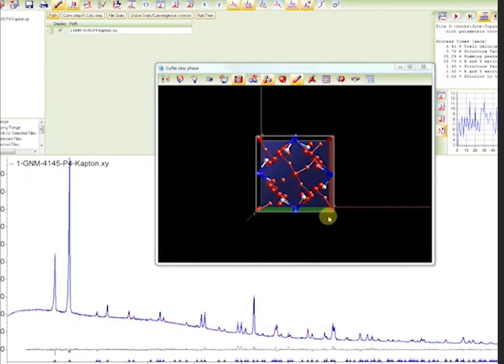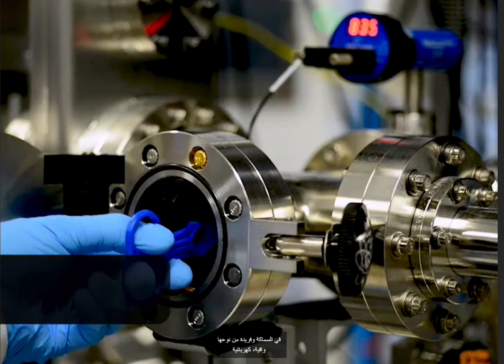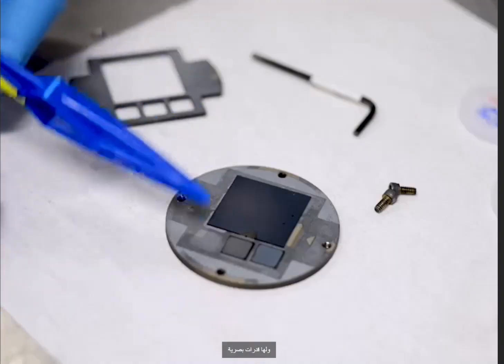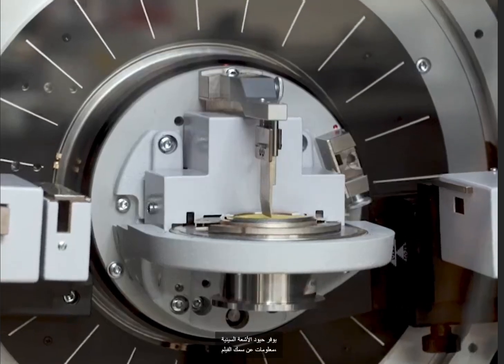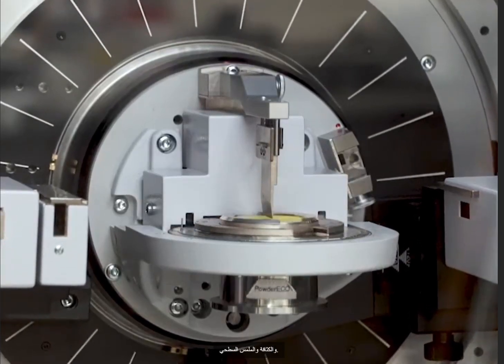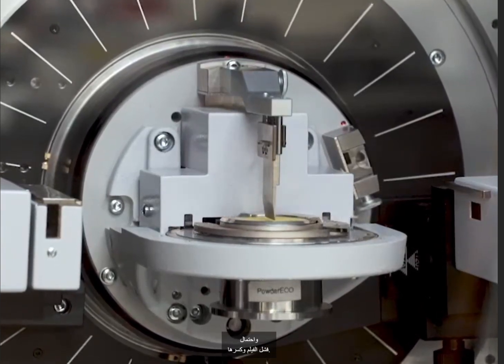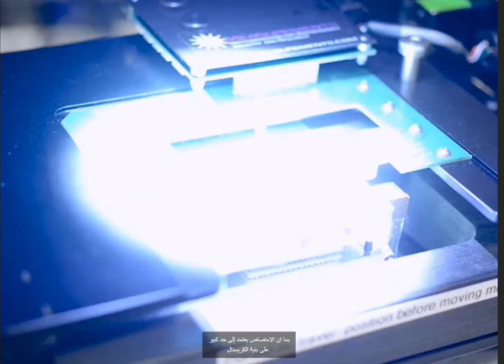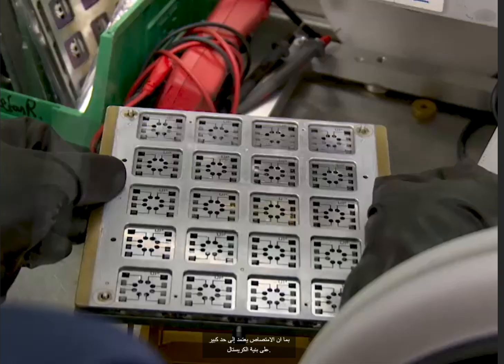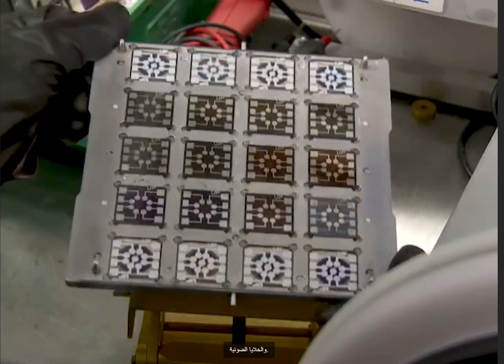Films of material ranging from nanometers to micrometers in thickness have unique protective, electrical, and optical abilities that differ from those of bulk materials. X-ray diffraction provides information on film thickness, density, and surface texture. It is used to determine film stress and the likelihood of film failure and breakage. It also helps characterize the optical behavior of films, since absorption largely depends on crystal structure. It is therefore used to characterize thin film light sensors and photovoltaic cells.